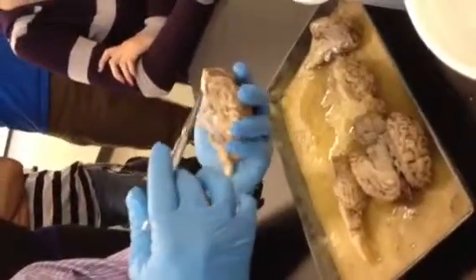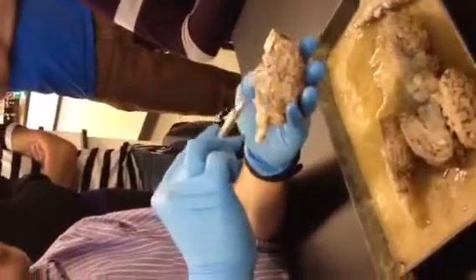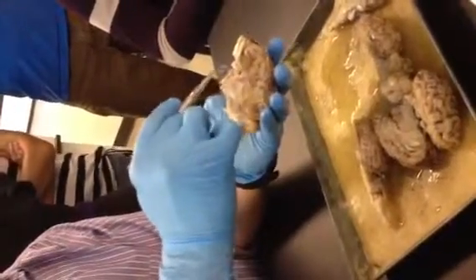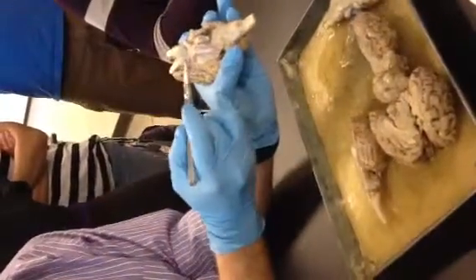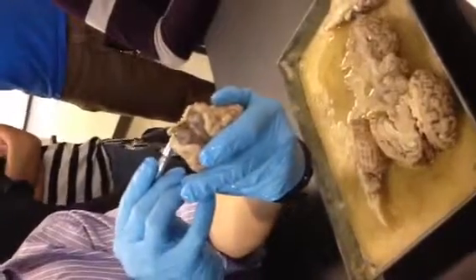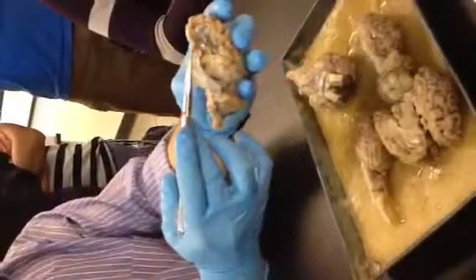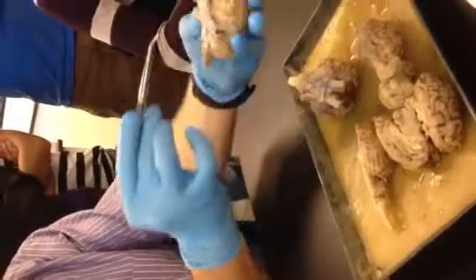Optic nerves. Optic nerves go to the eyeball. So the eyeball would sit here and also here on the sheep brain. So we've got this optic nerve going off to where the eyeball would be. This is optic nerve here and optic nerve there. Also, you've got an optic nerve, you can see this one cut down the midline. There's optic nerve there.